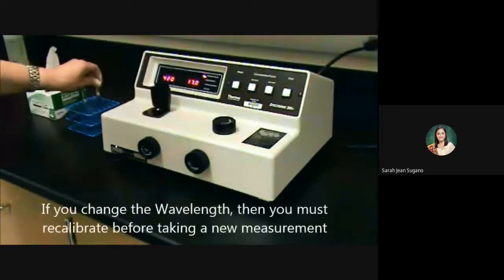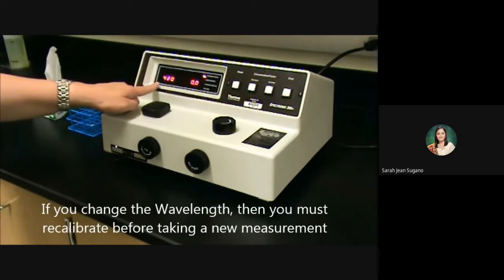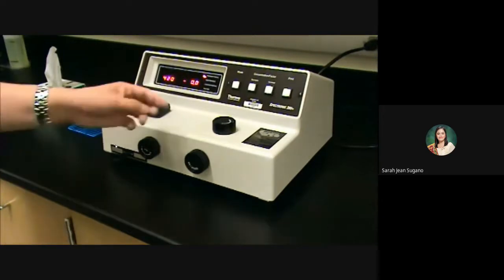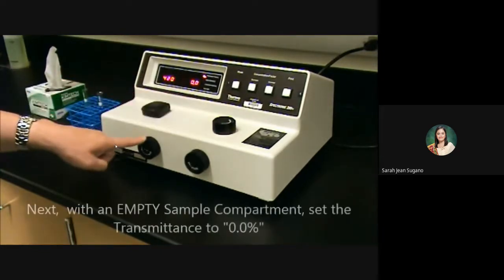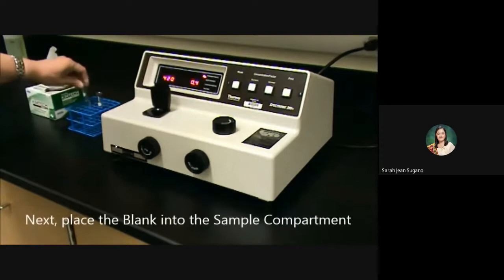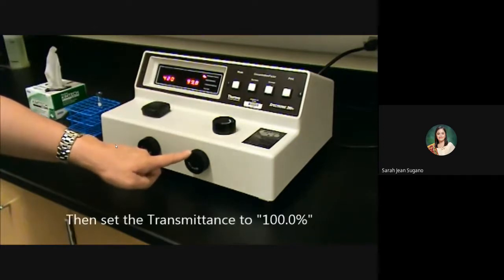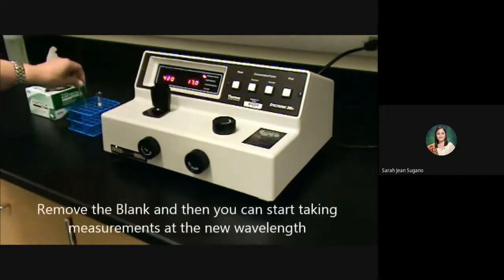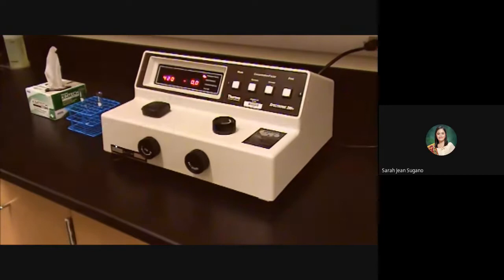But once you decide that you want to record at a different wavelength, let's say we want to switch from 420 to 480 nanometers, now we have to go through the entire calibration method one more time. So we'll begin by first changing the wavelength to the desired 480. We'll have to 0 the machine using the 0 control knob on the left. Then we'll have to put the blank cuvette back in. And then we'll have to use the knob on the right, the absorbance transmittance control, in order to set the machine back at 100% transmittance. And after that's complete, you can go ahead and put your sample in to read the absorbance or transmittance at the new wavelength.